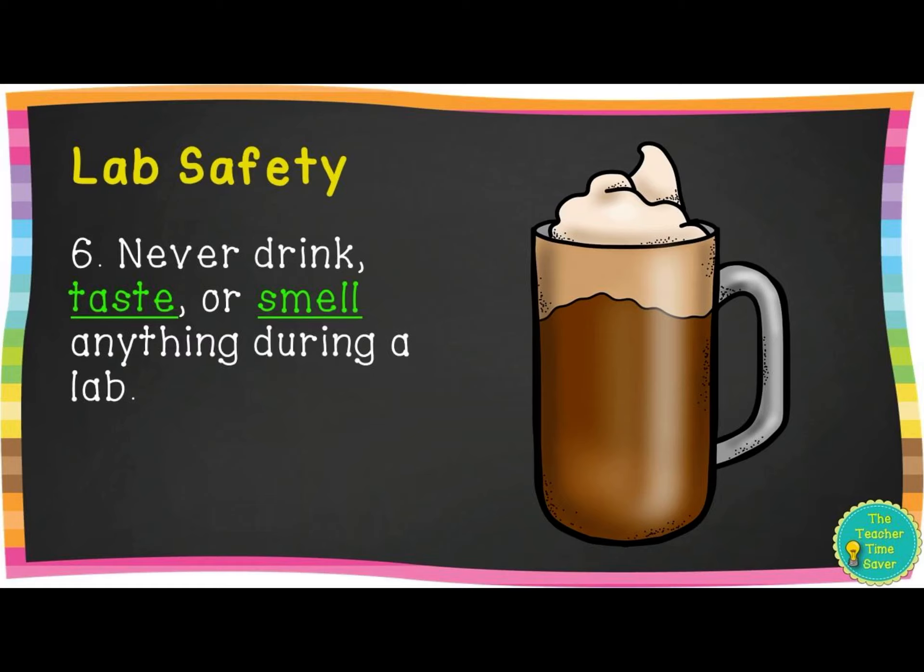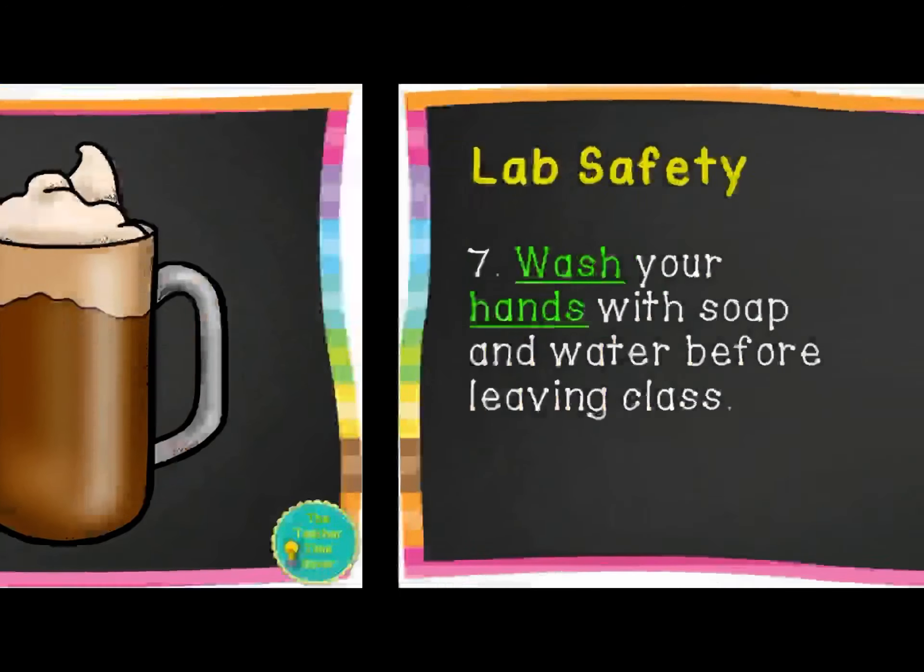Rule six: never drink, taste, or smell anything during a lab. This is really important, especially when you get to chemistry labs in high school and college, because a lot of the stuff you do labs with is really dangerous. If you taste it or even smell it, it can get into your body and do you a lot of harm — it can even cause brain damage. So be very careful about not tasting or smelling anything during a lab.